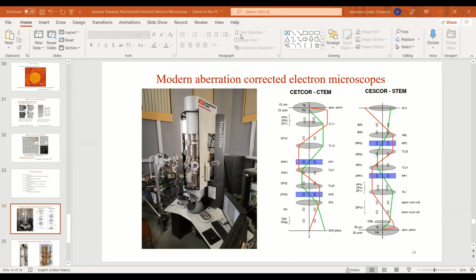I'm not working in the biological field, so I don't have any experience with the biological field actually. I am new in this field. So I got this little aberration. Here is one more question. From the lecture, what I got is that little aberration should still be there to get low Z elements detection. Am I right? If yes, can't we have any solution to it?